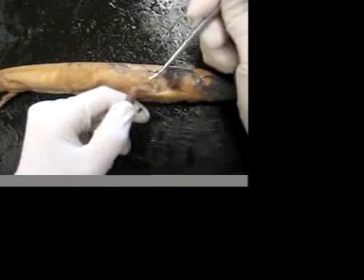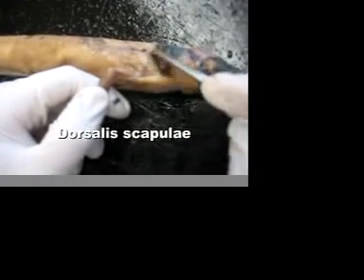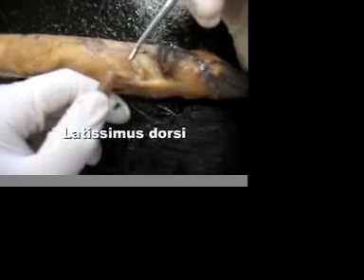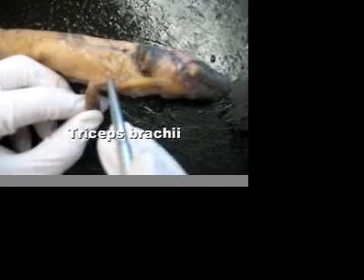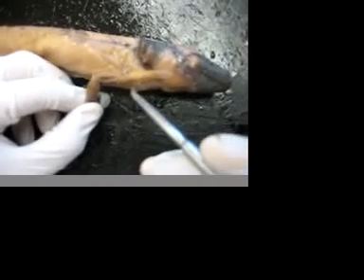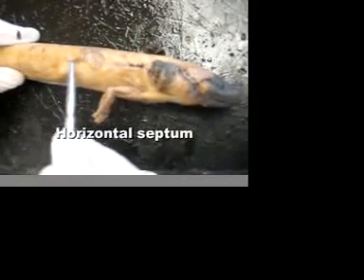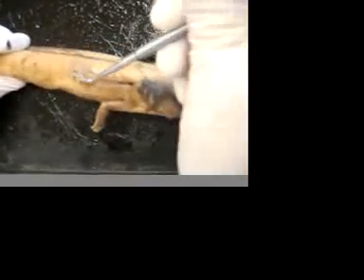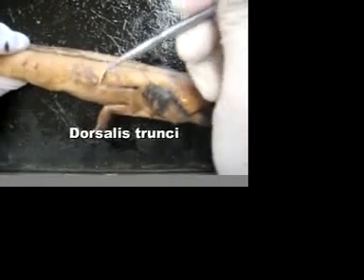Coming up from the arm, we have dorsalis scapulae right here. Latissimus dorsi comes off of it like that. Triceps brachii is right there. We also have the procoracohumeralis again. The horizontal septum goes along right here, and the dorsalis truncae is all the muscles that are in there.